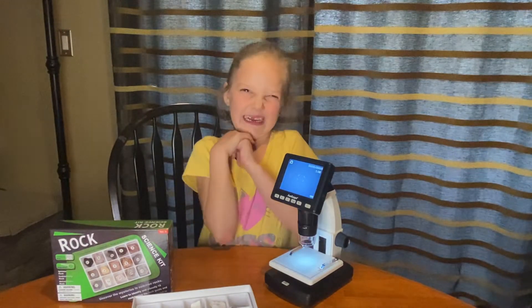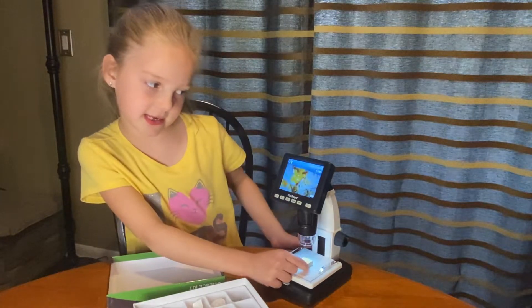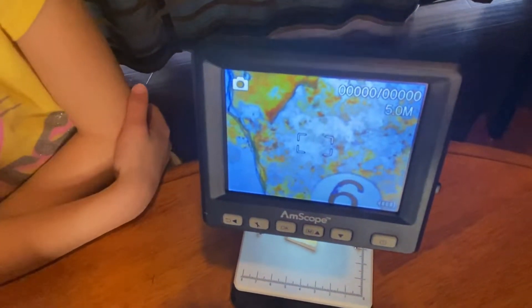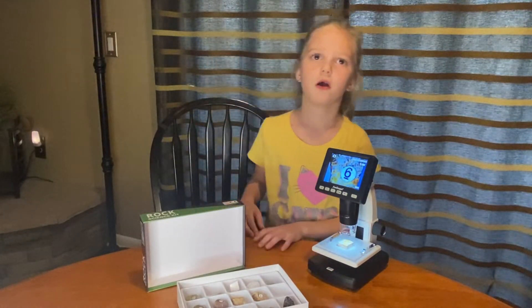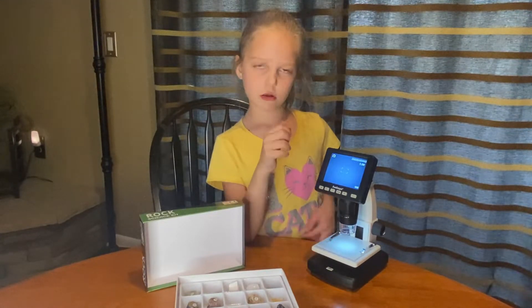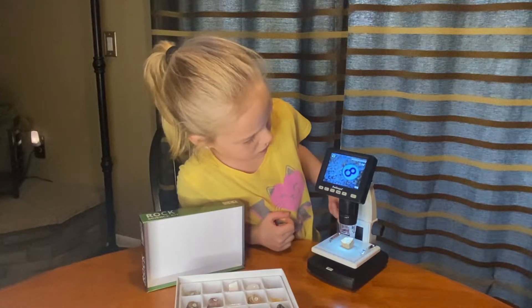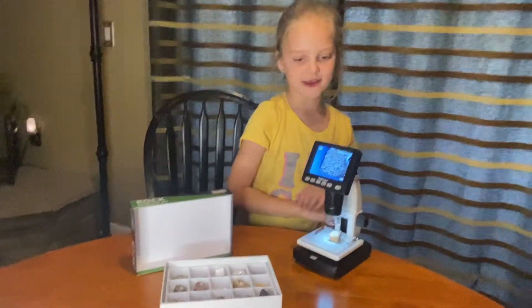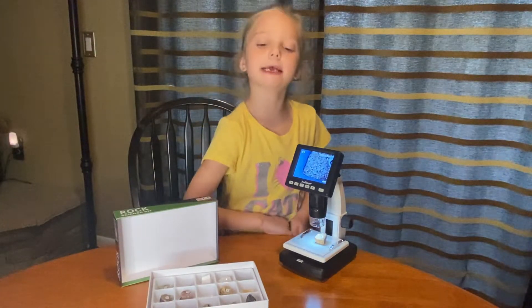My mom scrubs her feet with that. This is a shale. Wow, it kind of looks like a sunset — get it into focus. I think it looks like a pepperoni pizza. I think it looks like a cheese pizza. Give me a thumbs up if this looks like a cheese pizza. Sandstone. Does that mean it's made out of sand? Give me a thumbs up if it's made out of sand. That looks like a type of cereal — it looks like cinnamon toast crunch.